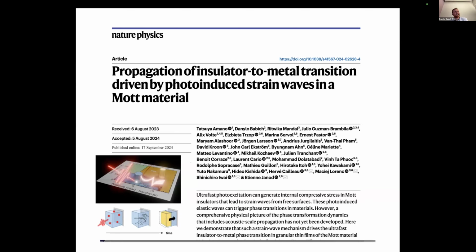The take-home message of this research is that when you start from steady-state measurements and progress with your studies, it opens the door to another research direction related to ultrafast and time-resolved measurements. For example, this last paper was published thanks to our measurements at a time-resolved beamline and FemtoMAX in Lund, so we summarize both sides of the synchrotron community: synchrotrons and free electron lasers.